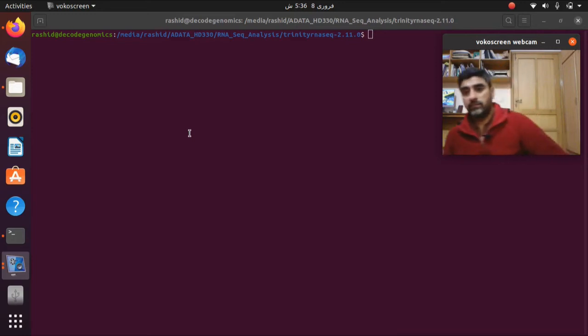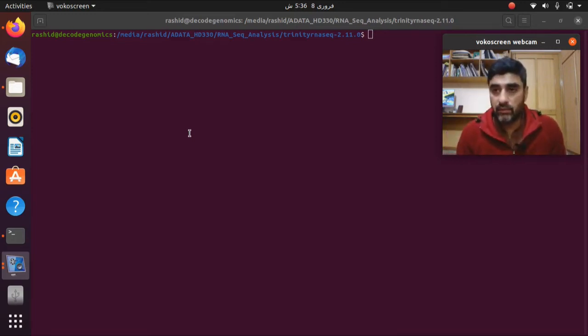Bismillahirrahmanirrahim. Okay, dear listeners, now we are going to perform step number 5 of our RNA-Seq differential expression pipeline. In this step number 5, we are going to do just the counting of the number of expressed transcripts in our data.